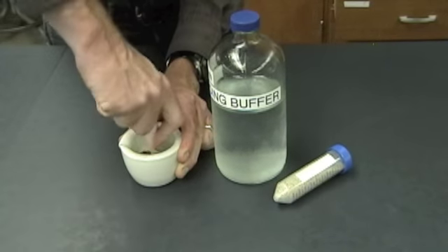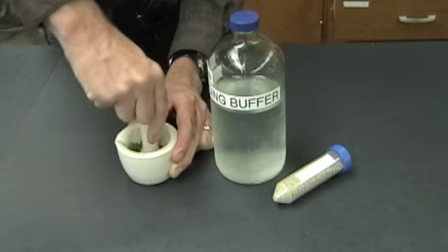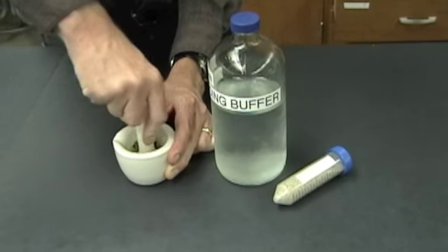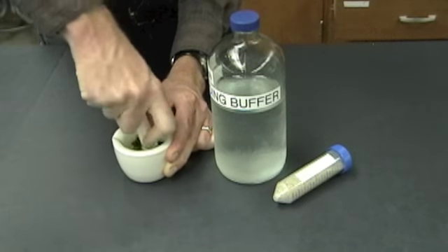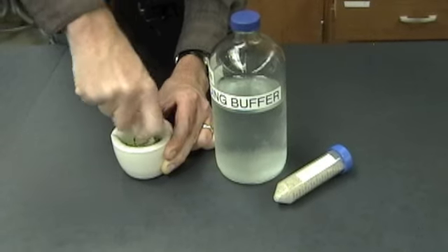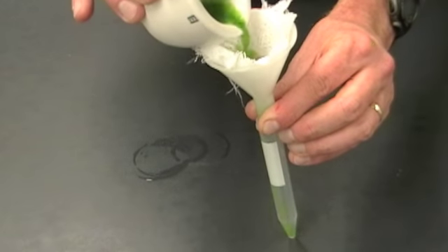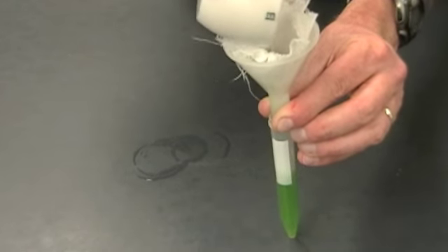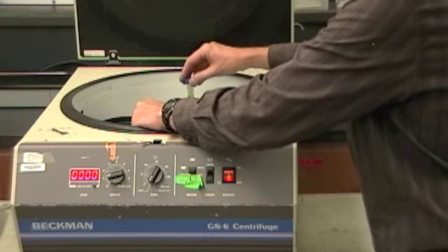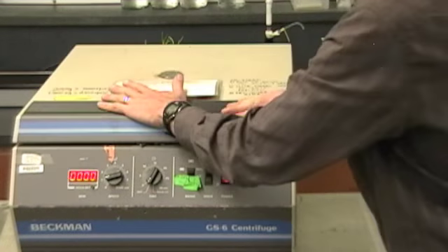The first thing you're going to do in this lab is isolate chloroplast, and you do that by grinding up spinach leaves. Now, the procedure is pretty straightforward, and your TA will review it with you, but you're going to grind up the leaves in a buffer. You're going to filter those leaves to get big chunks out. And then finally, you're going to spin them in a centrifuge.